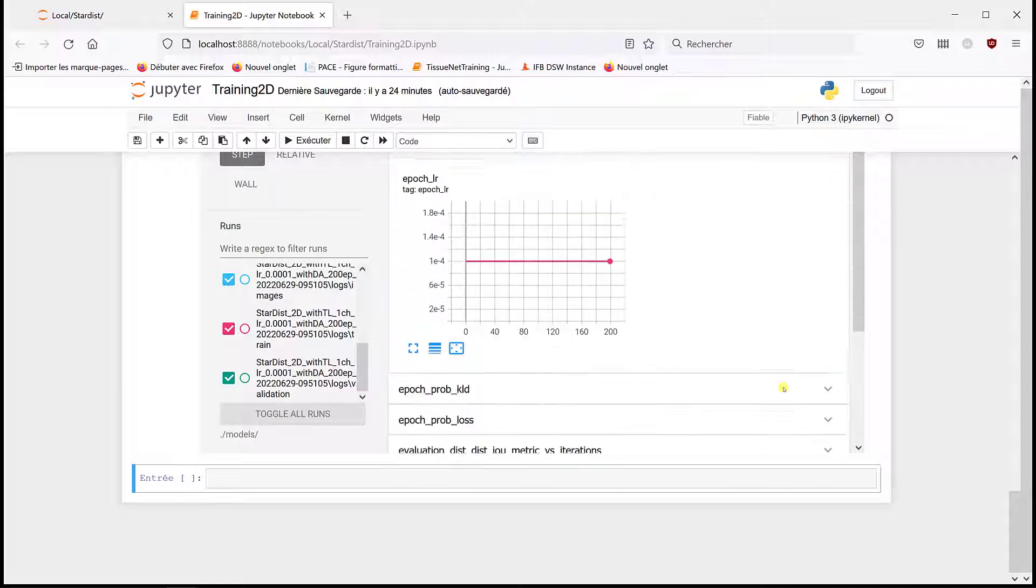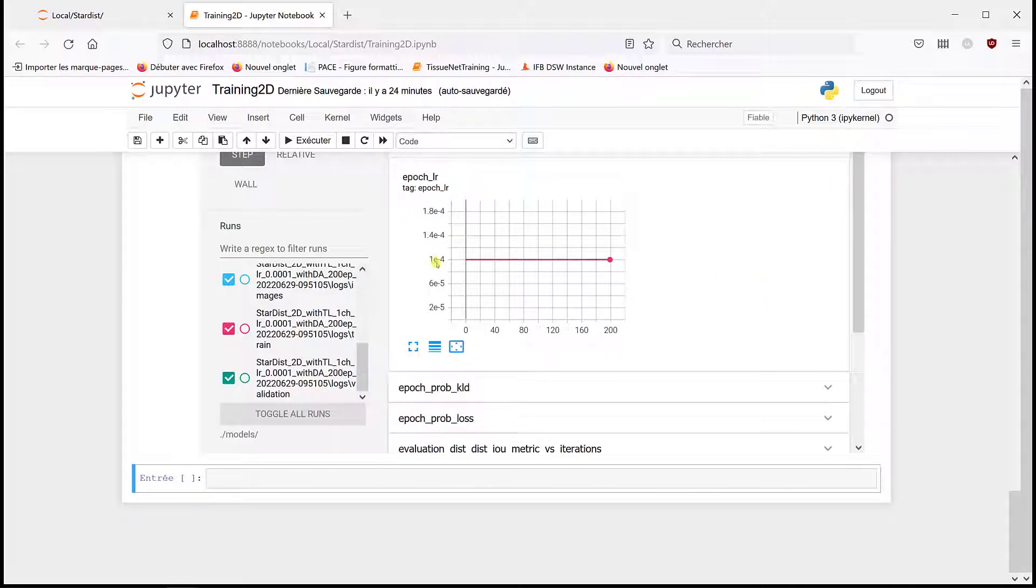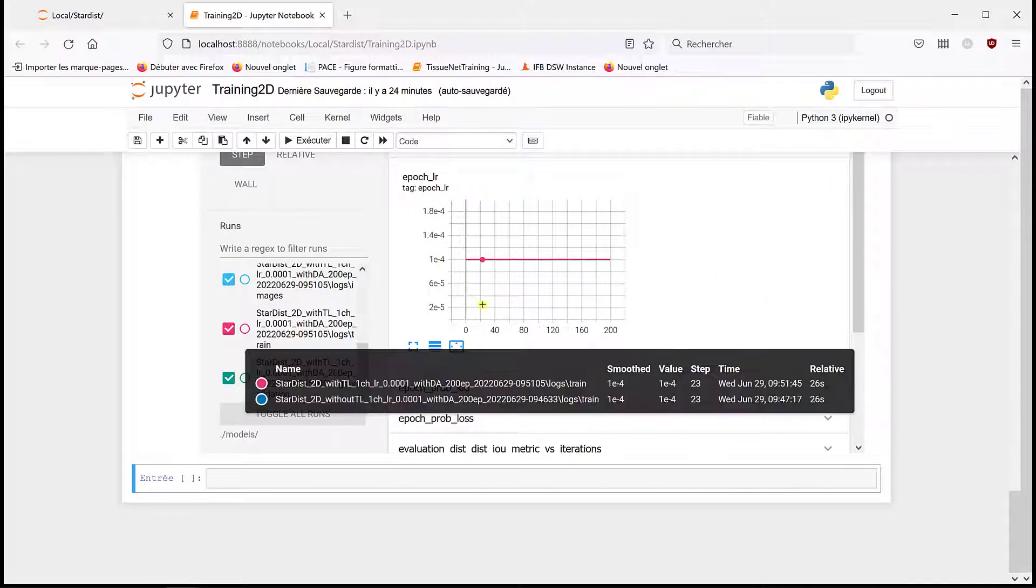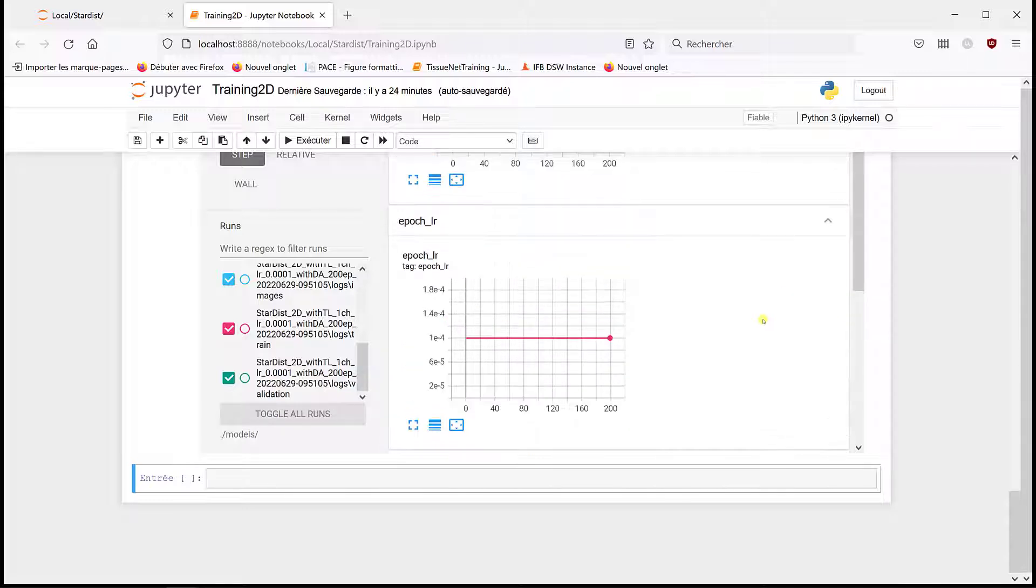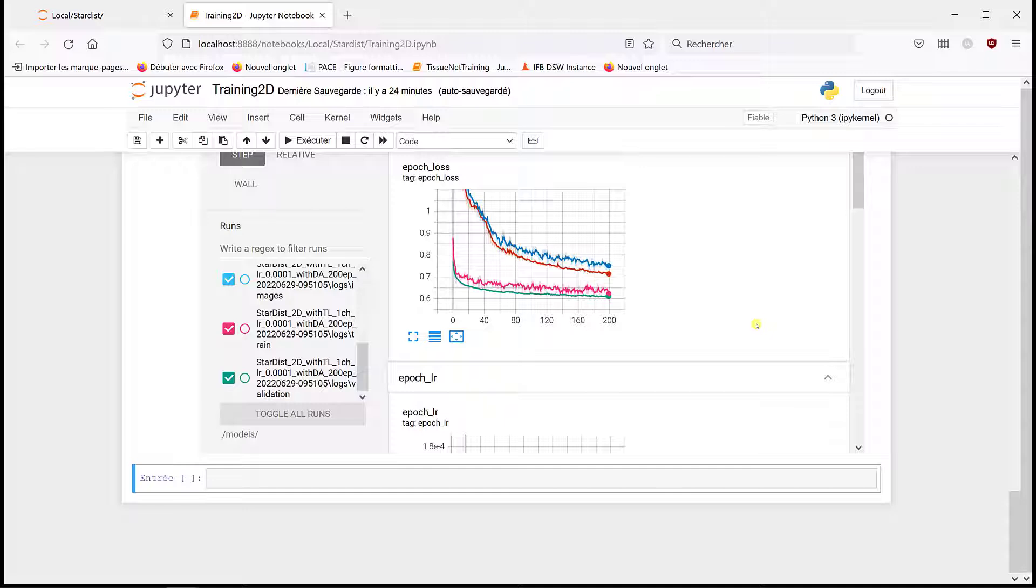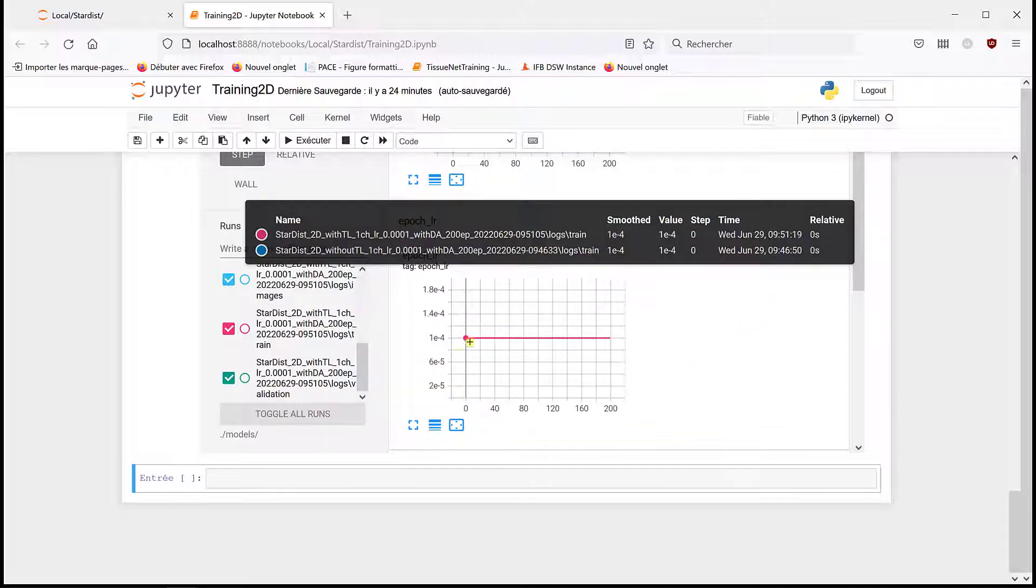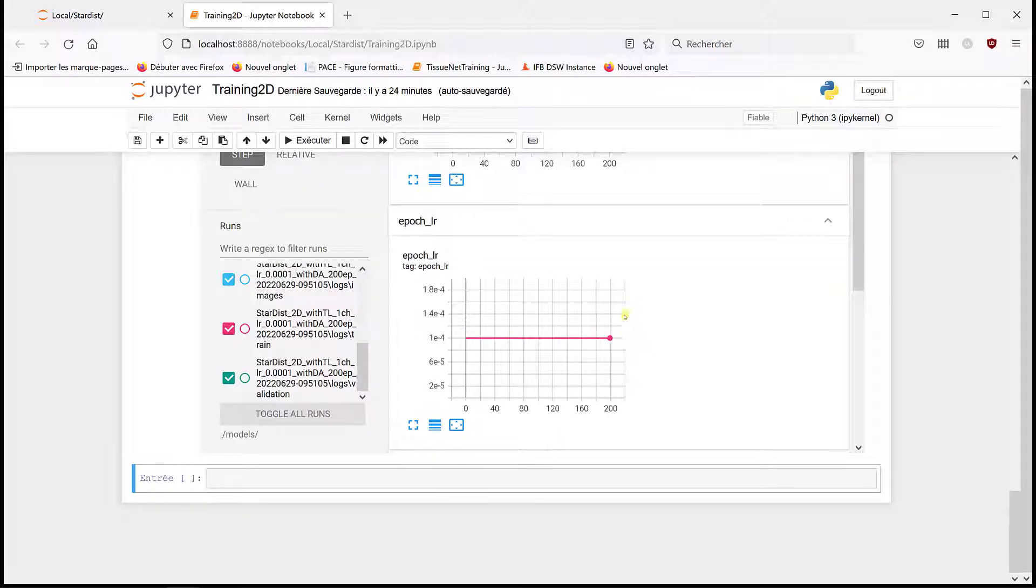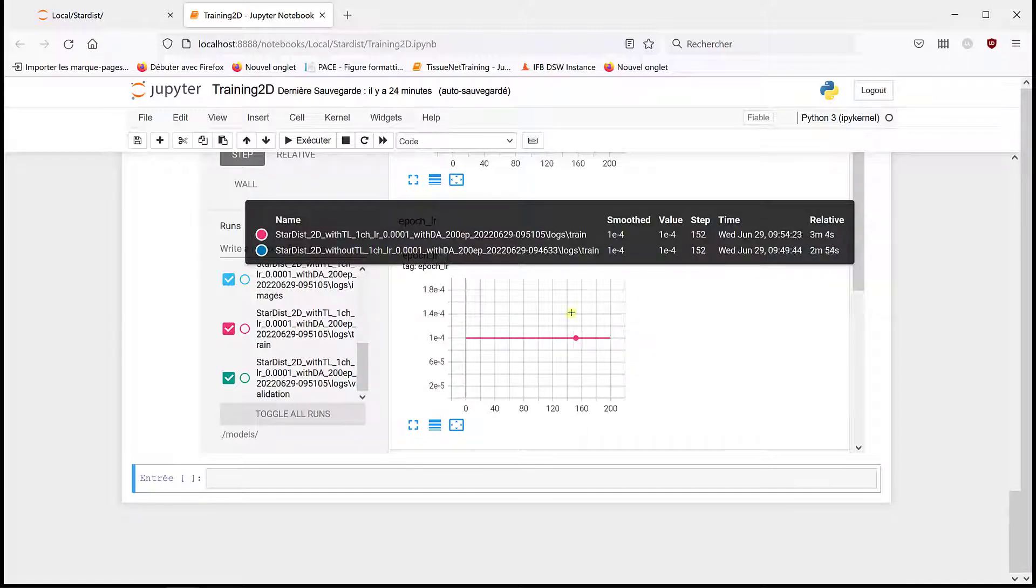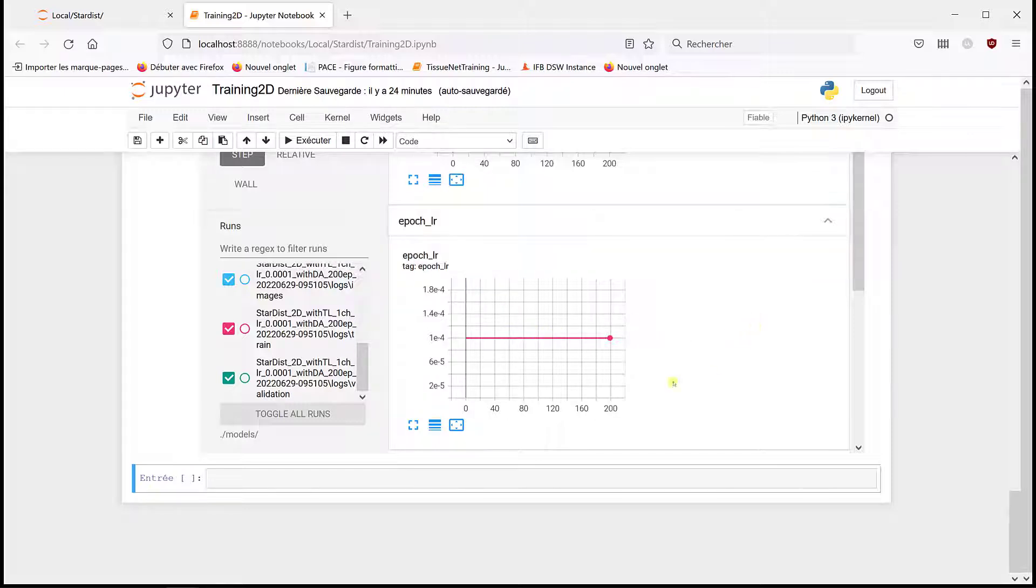And a good clue about that is to look at the learning rate. The learning rate was initiated at 1e-4, and it's going to go down if we have a loss which doesn't decrease anymore. And as we can see here, it never decreased.